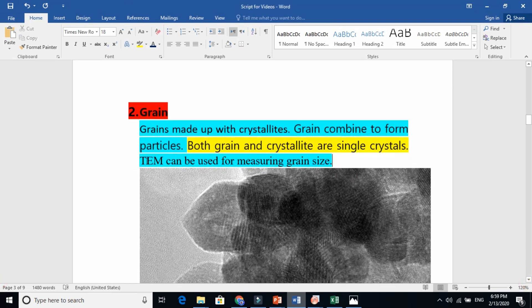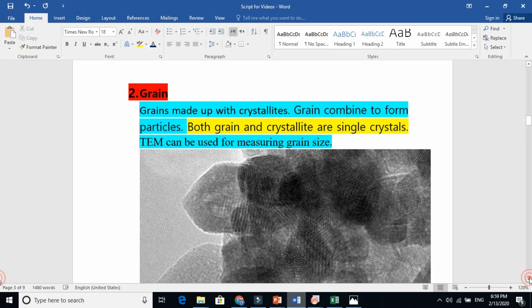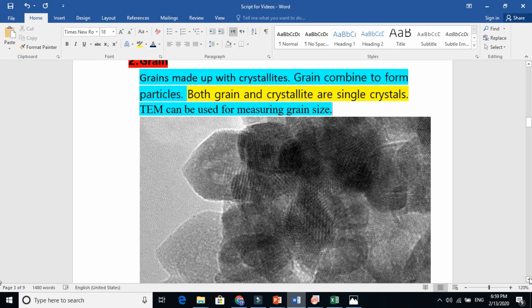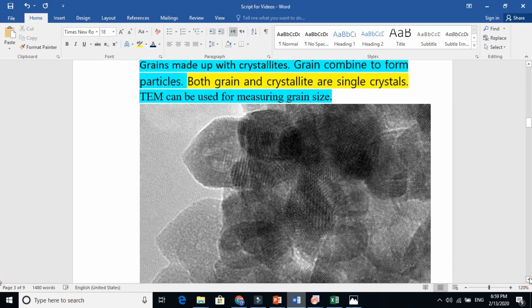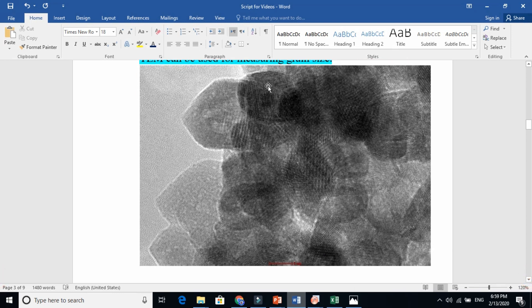We use TEM micrographs to measure the grain size. We also use XRD and the Scherrer formula to find the full width at half maximum, and from there we find the crystallite size — I will show that in another video. And here you use ImageJ software to measure the grain size.